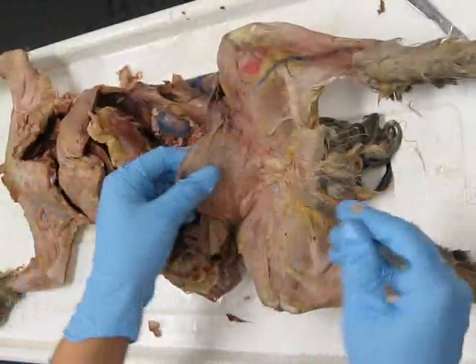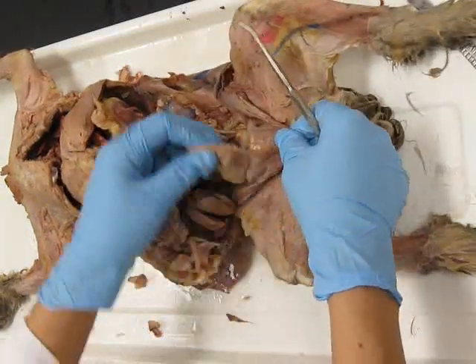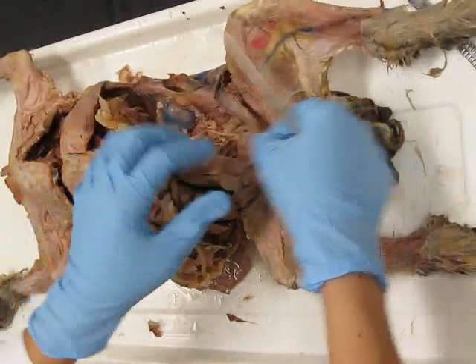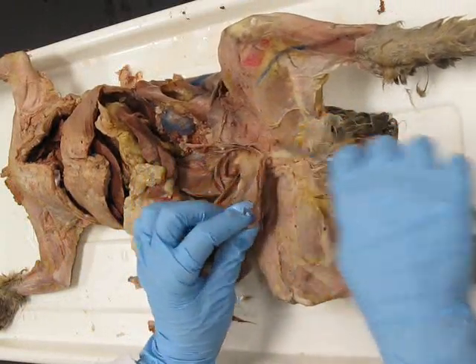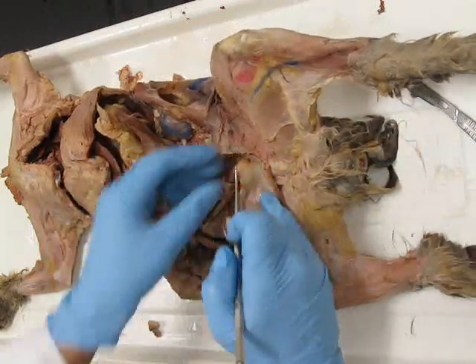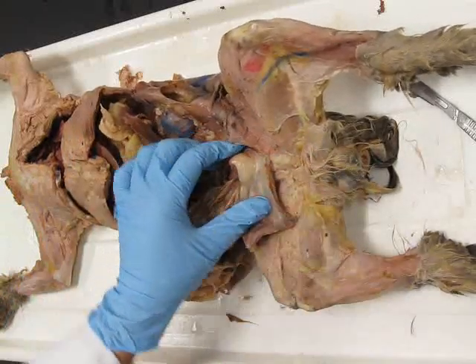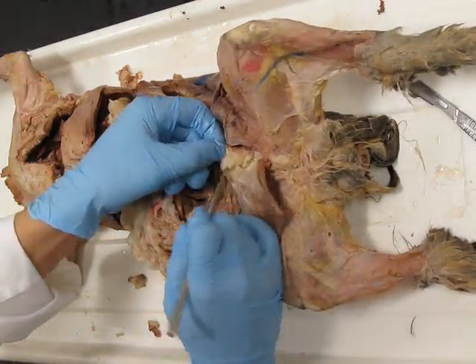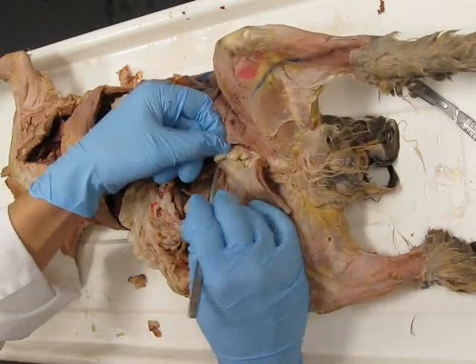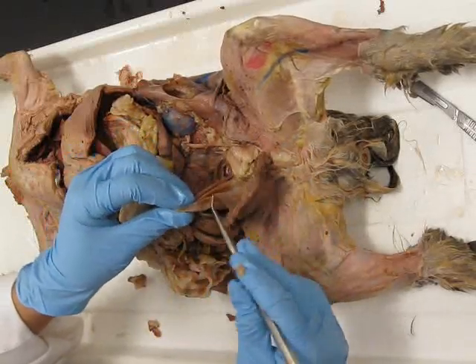Okay. Now, for the urethra, you need to make an incision along the abdominal muscle wall, but you don't want to cut through that median umbilical ligament. So go to either side, not down the middle. And you're just going to cut all the way to the body wall, like that. Okay. Then, this little blob of fat is always here, the base of the urinary bladder. You're going to use blunt dissection and just go right through that blob of fat, like this. And you're looking for a tube coming from the bottom of the bladder. Okay. Be careful not to cut off this median umbilical ligament.